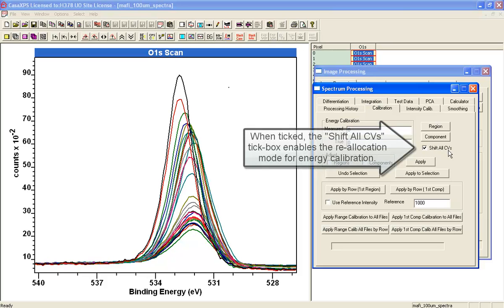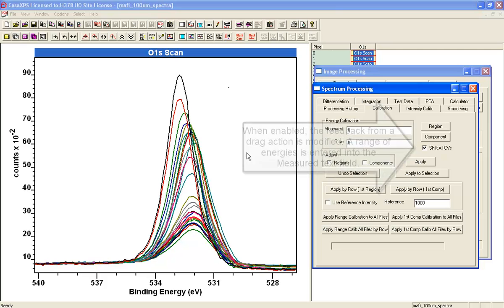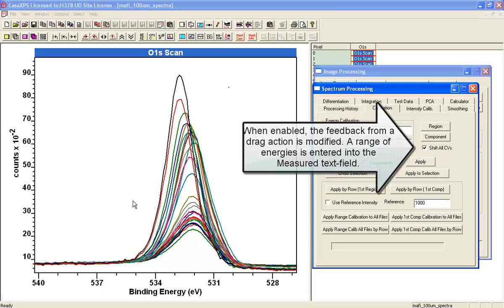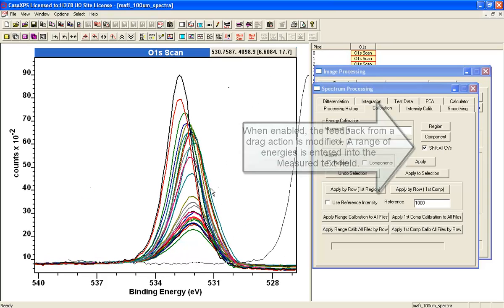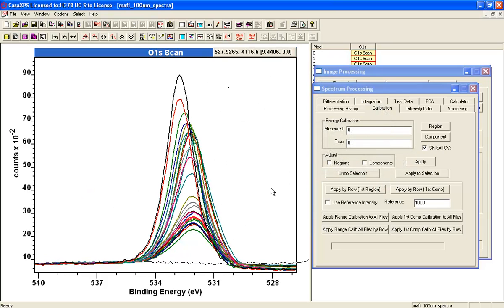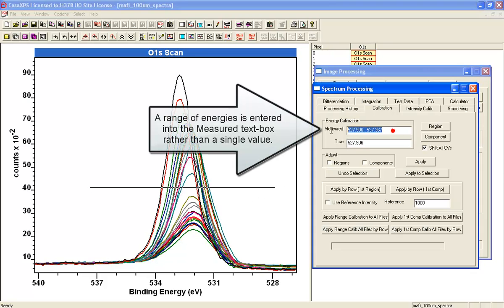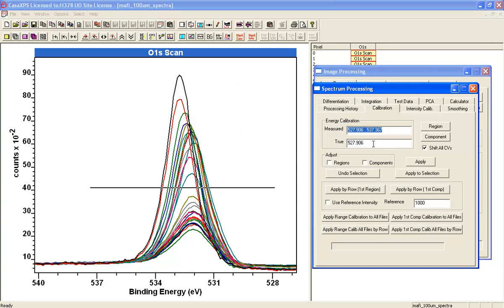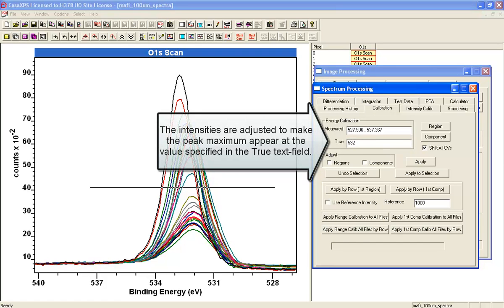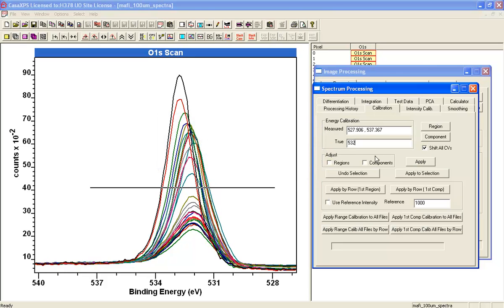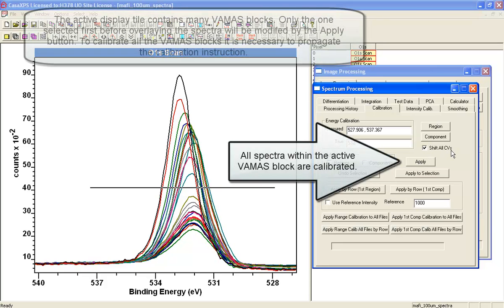I'm going to say shift all the corresponding variables, and that's referring to the different columns of spectra corresponding to pixels within the image. If I hold the control key down with this ticked and use the cursor, I can mark out an interval which has now been entered here. That's the range of values that will be looked at when this calibration is performed. I enter a true value—I've just used a reference value 532—and when I say apply with this button here, shift all CVs.